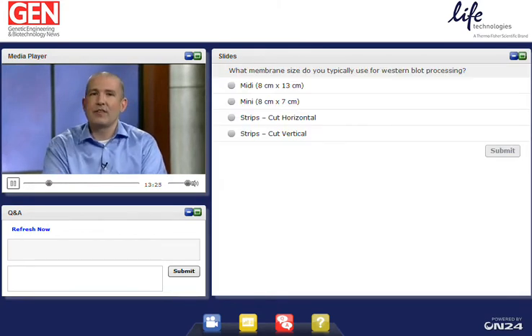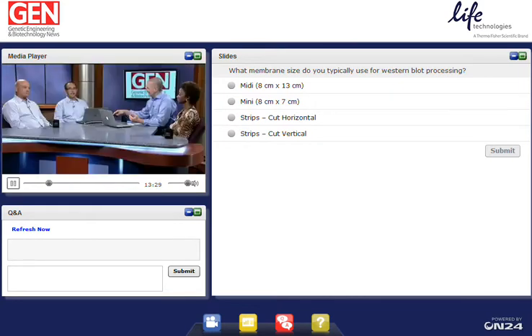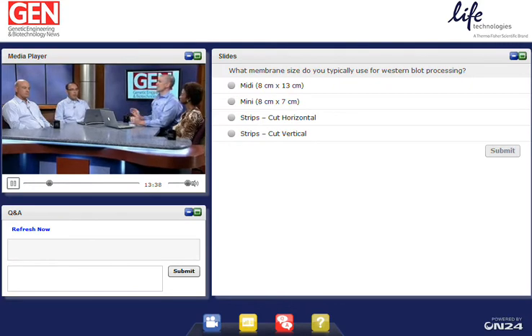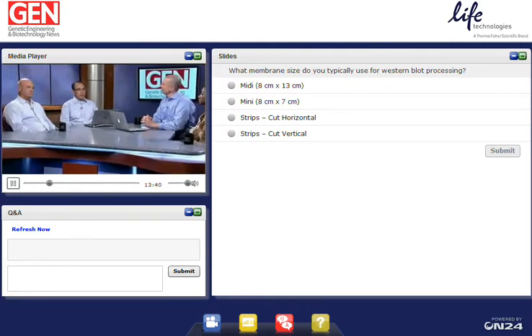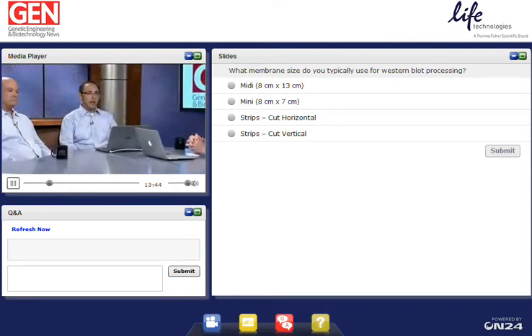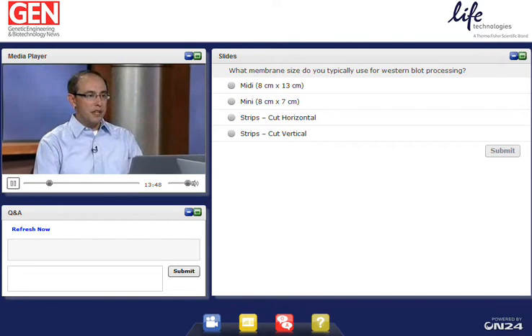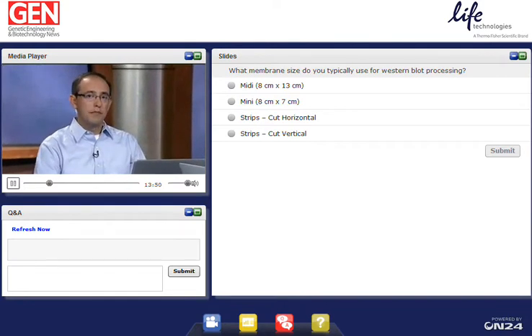So I guess now back to Kevin for one more poll question before we continue. Great. Thanks, David. So with that, we'll pause again for one final poll question. What membrane size do you typically use for Western blot processing? So do you use midi-sized blots, mini-sized blots, or do you cut your blots into strips either horizontally or vertically? So take a few minutes here to submit your response.